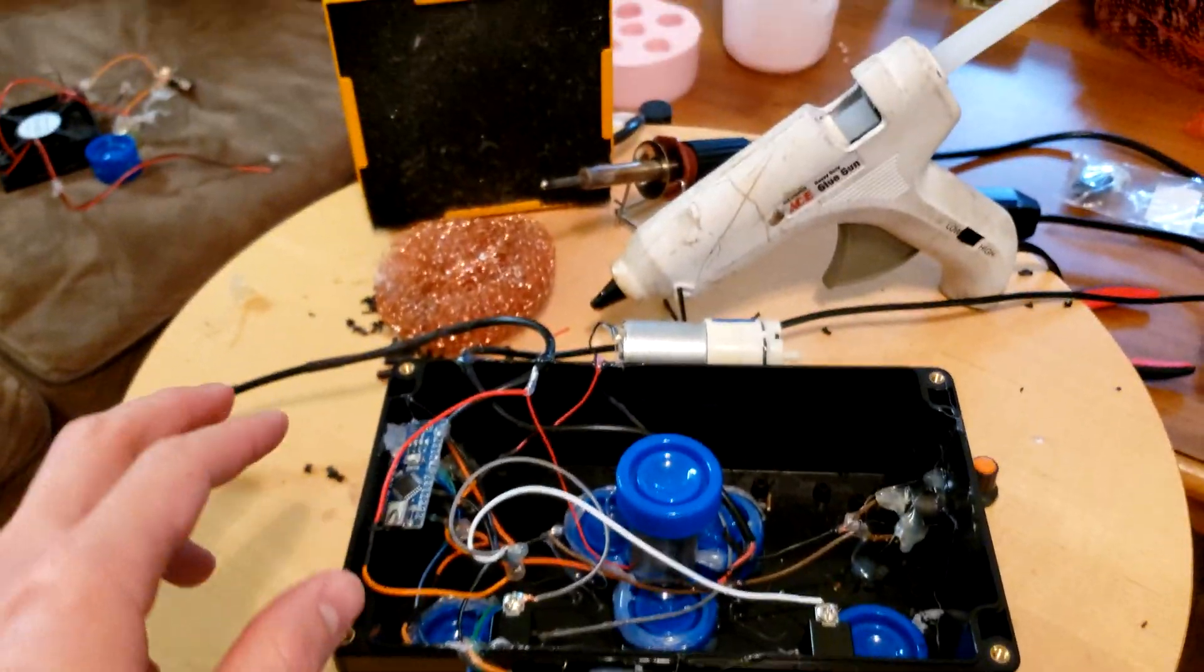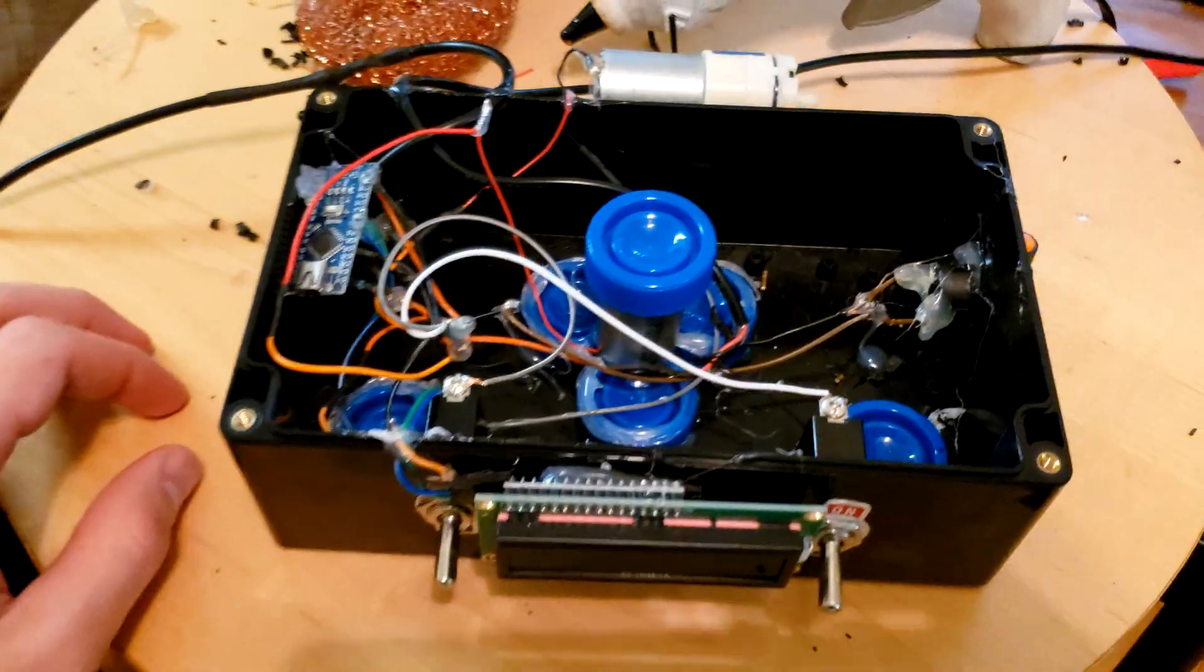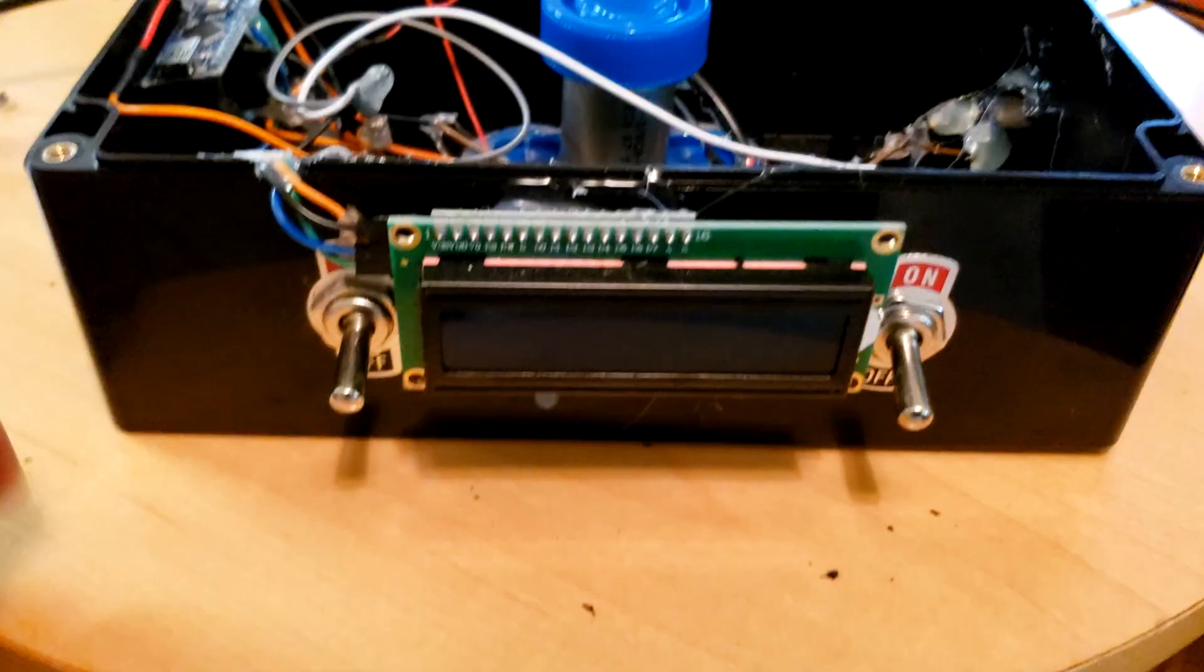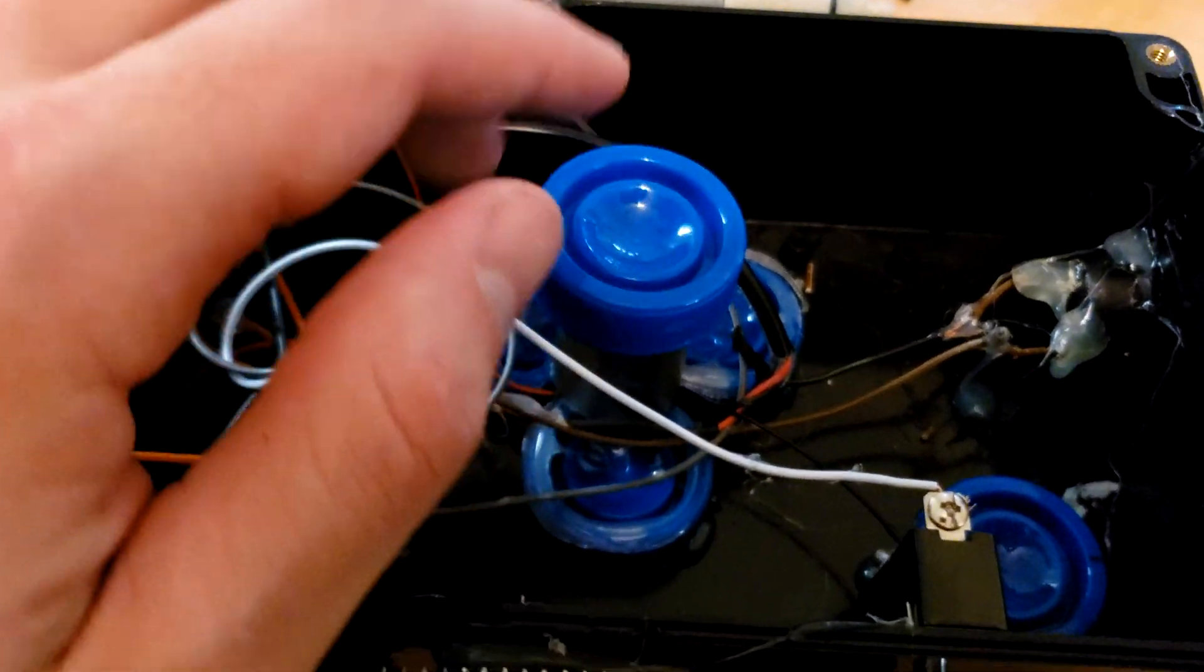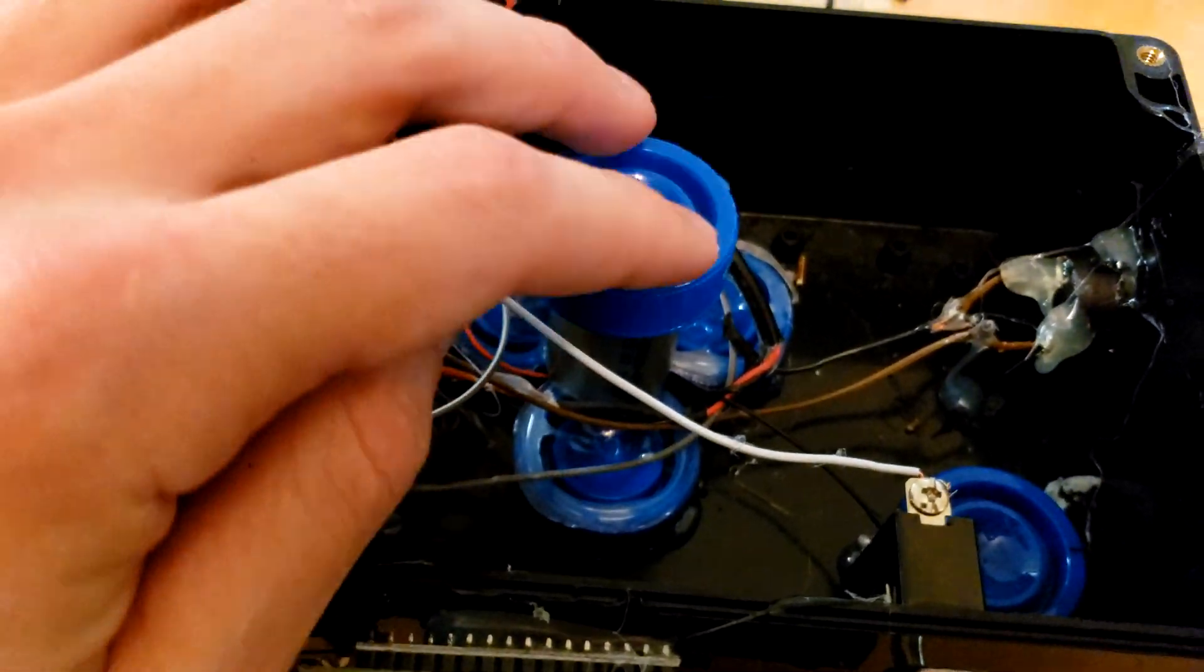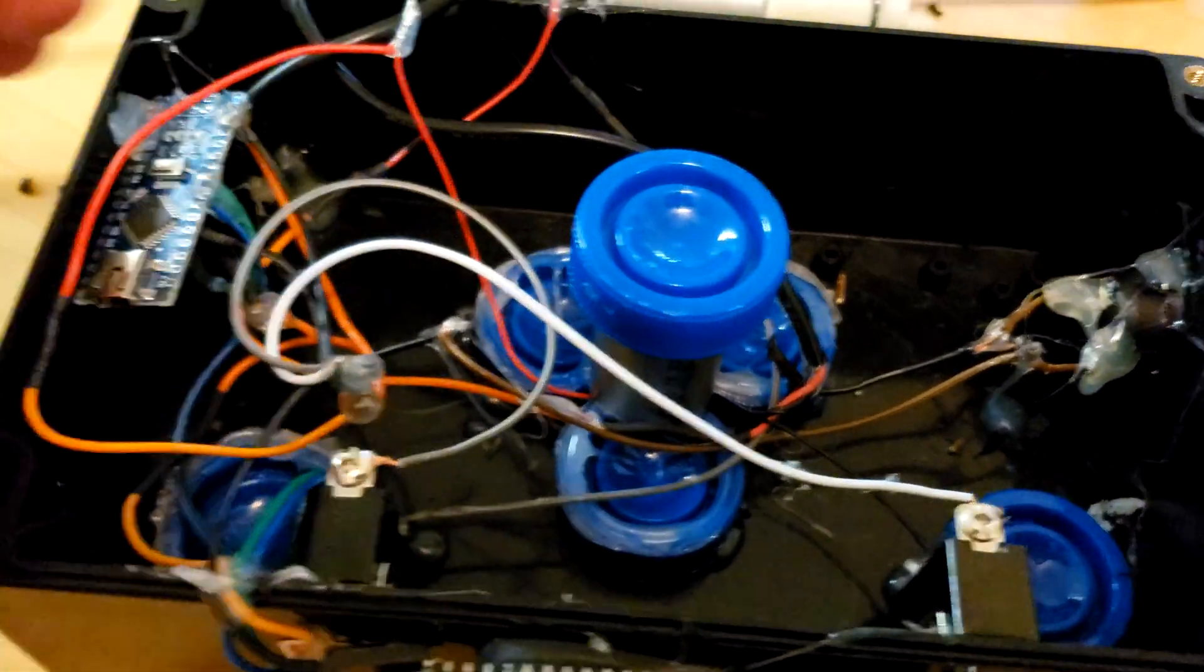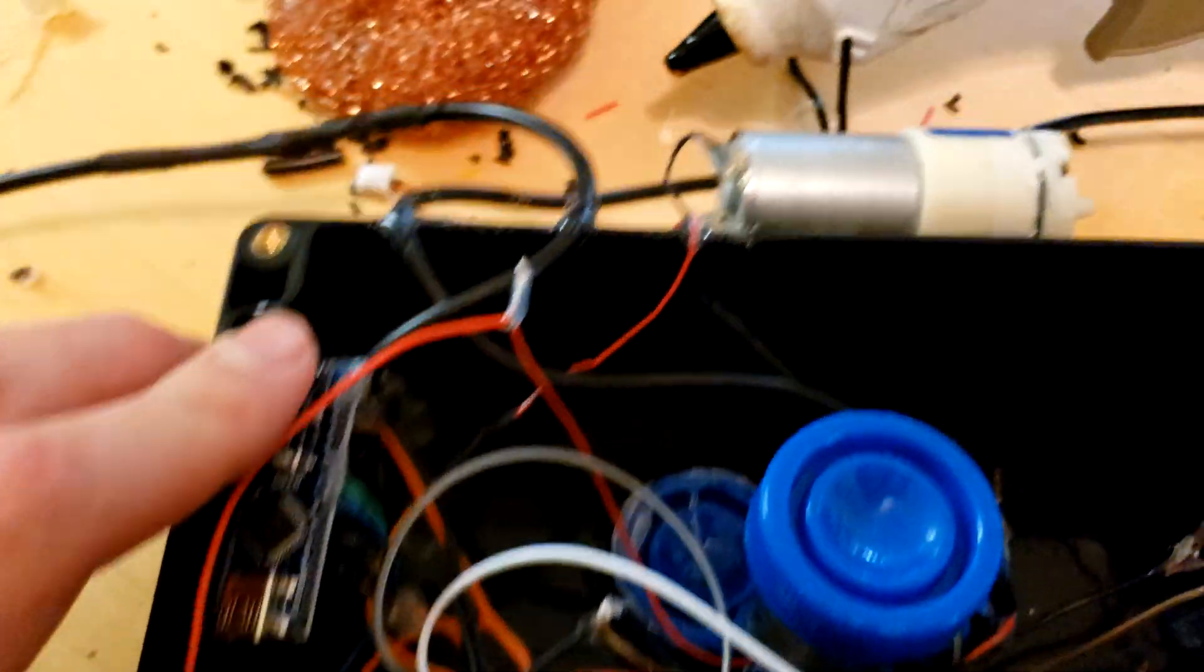Okay, I think I'm done. I've made an enormous mess. This is it right here, not that. So you can see we have our two switches, we have our display. We have a little DC motor in here that I need to put magnets on for the stir plate. Our little Arduino just glued to the wall.